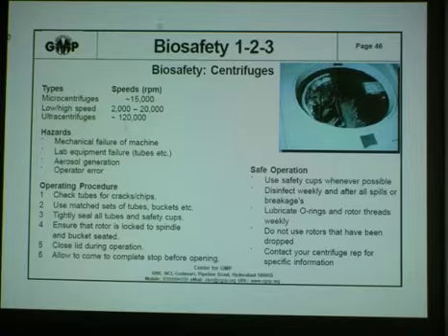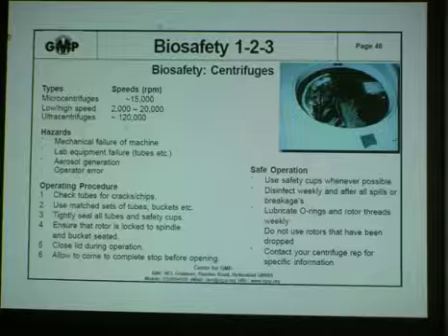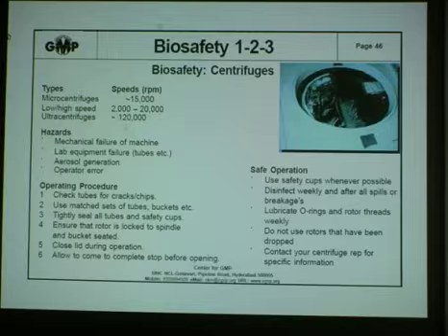Further tips for safe operation: use safety cups whenever possible. Disinfect weekly and after spills or breakages. Lubricate O-rings and rotor threads weekly. Do not use rotors that have been dropped. Contact your centrifuge rep for specific information.